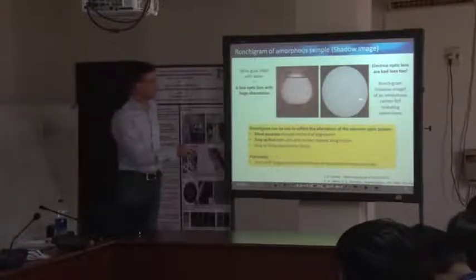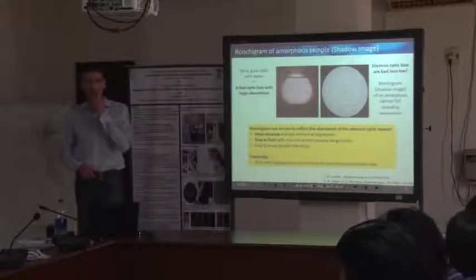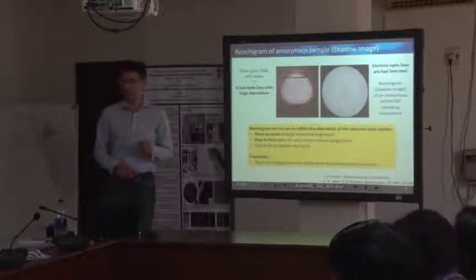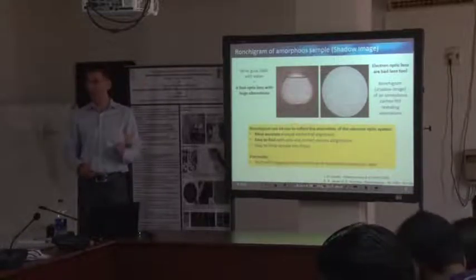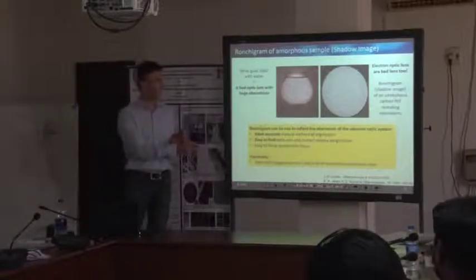And there's one further aspect. It helps a lot if you have an amorphous region of your sample to do the alignment. In many cases, even for crystalline materials, at the edges of a TEM sample you can find at least 1 or 2 nanometers of an amorphous region. This is sufficient to align your electron probe.